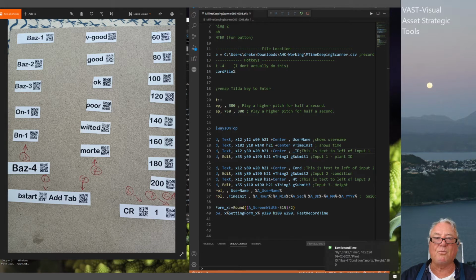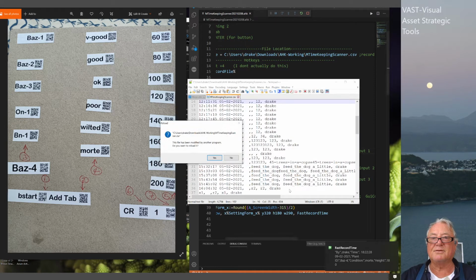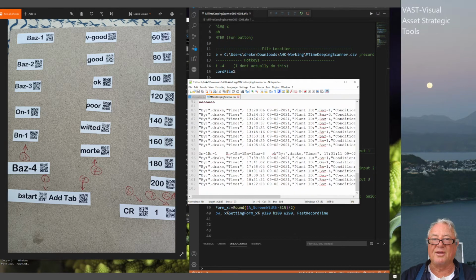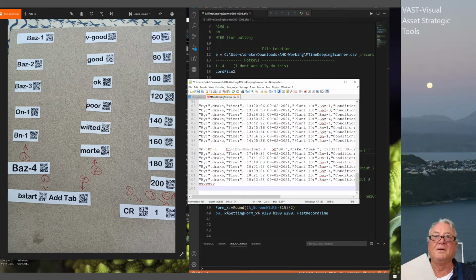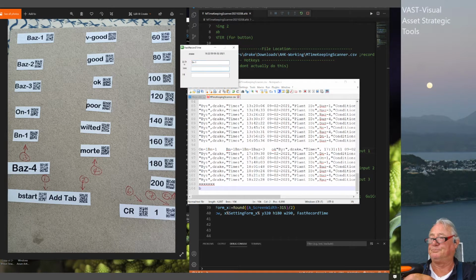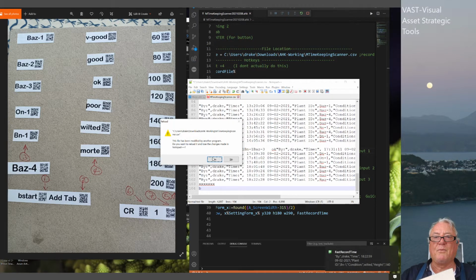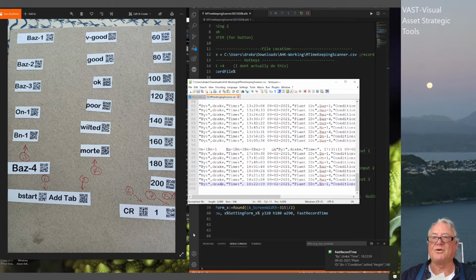do that. So straight away that has written it into, let's just drag down, yes, and it's just added another line through there. So if I just do an XX and we just come down to a new line, enter, and if I do that again, start, that one's there is refreshed, and we've suddenly got new data coming through there back straight away.